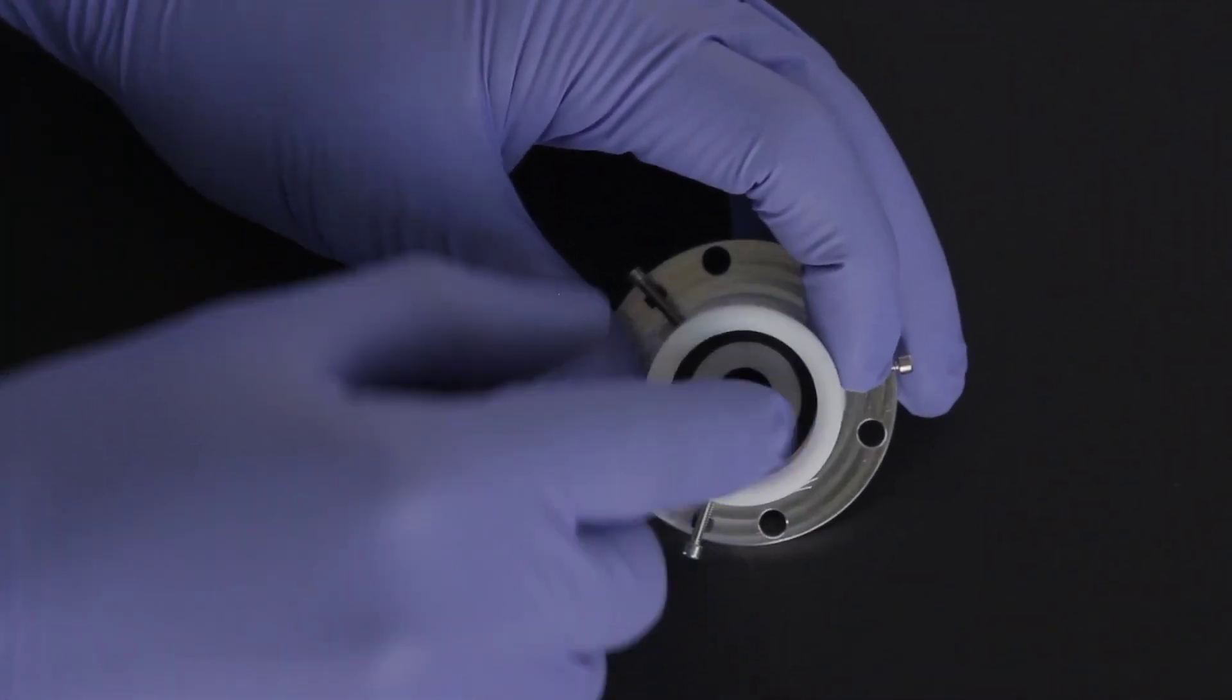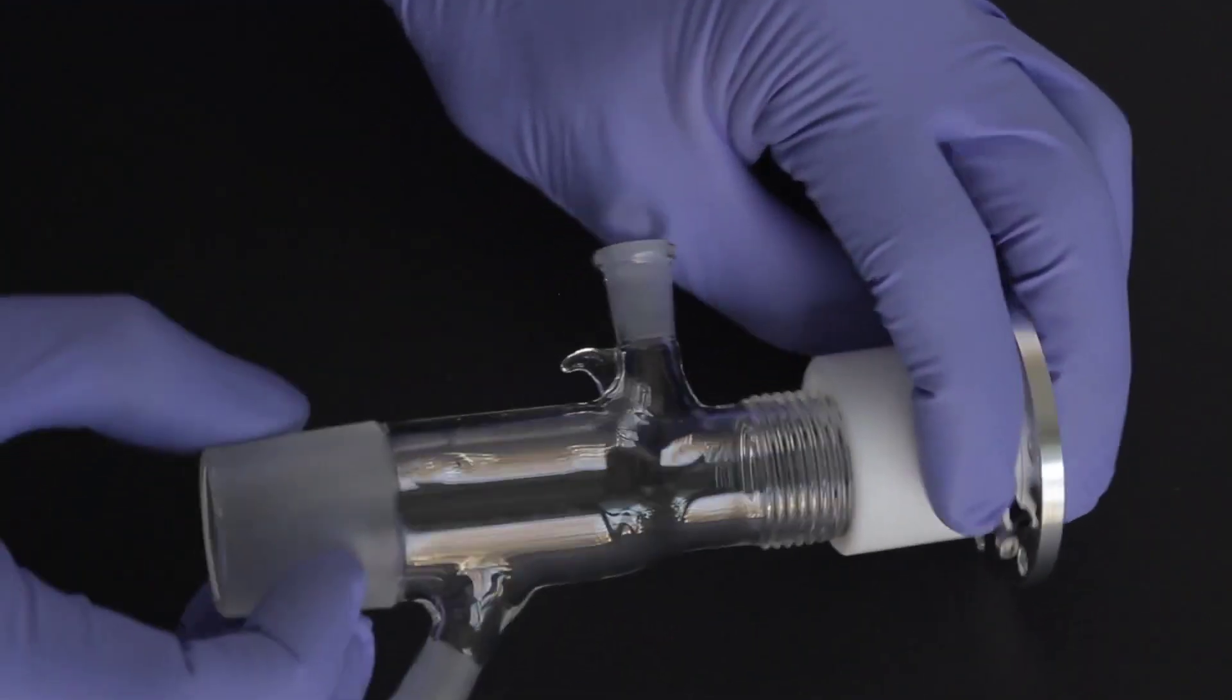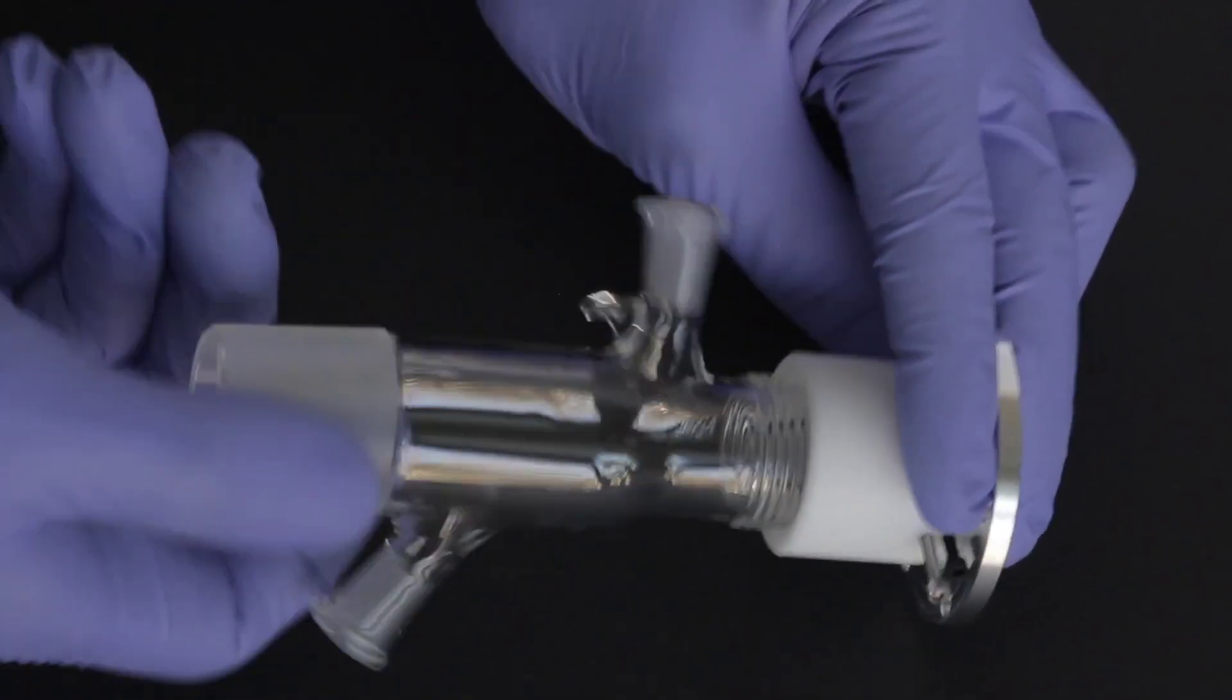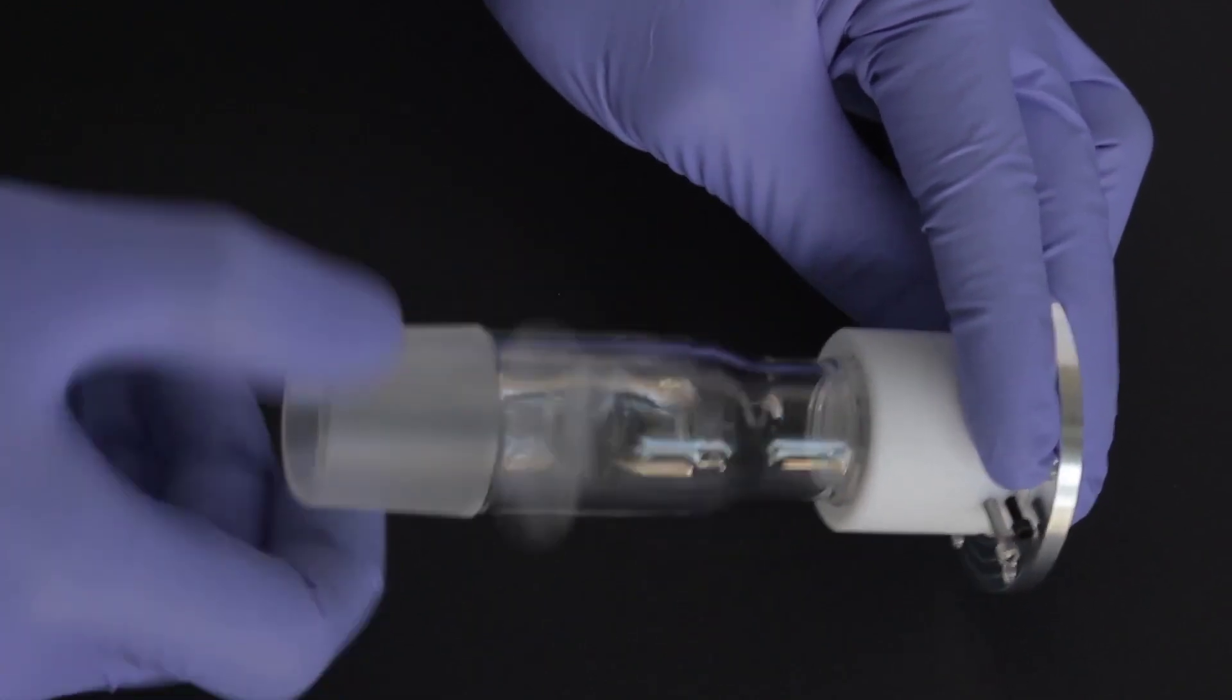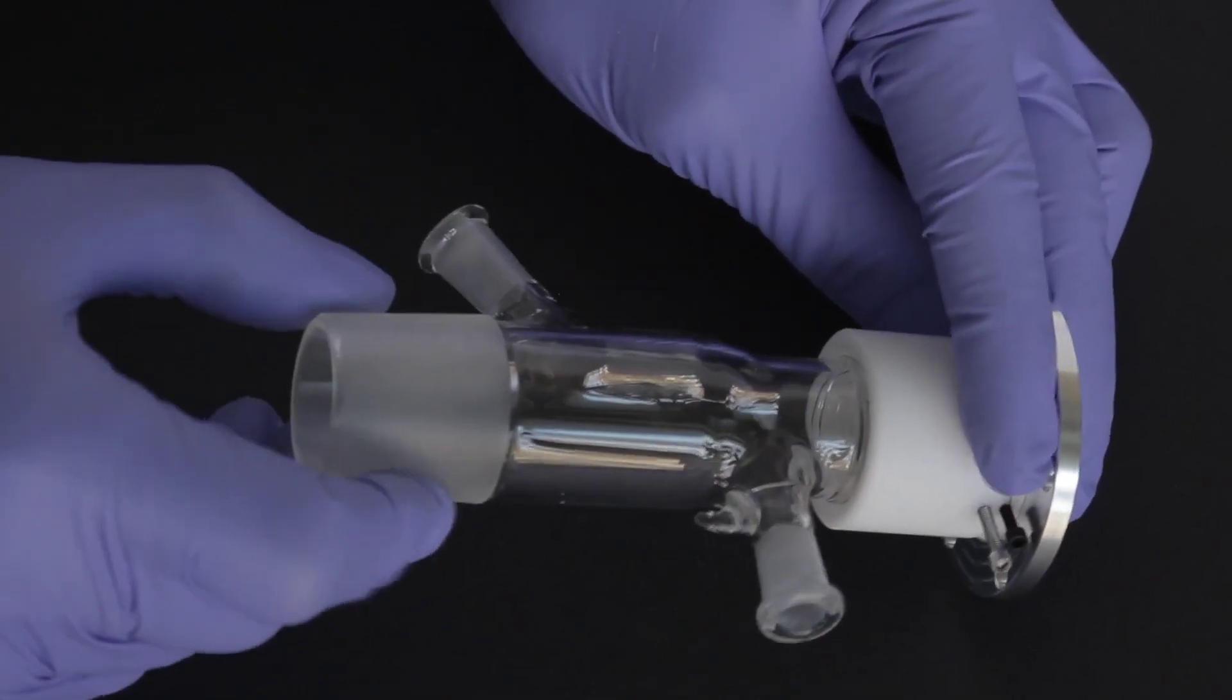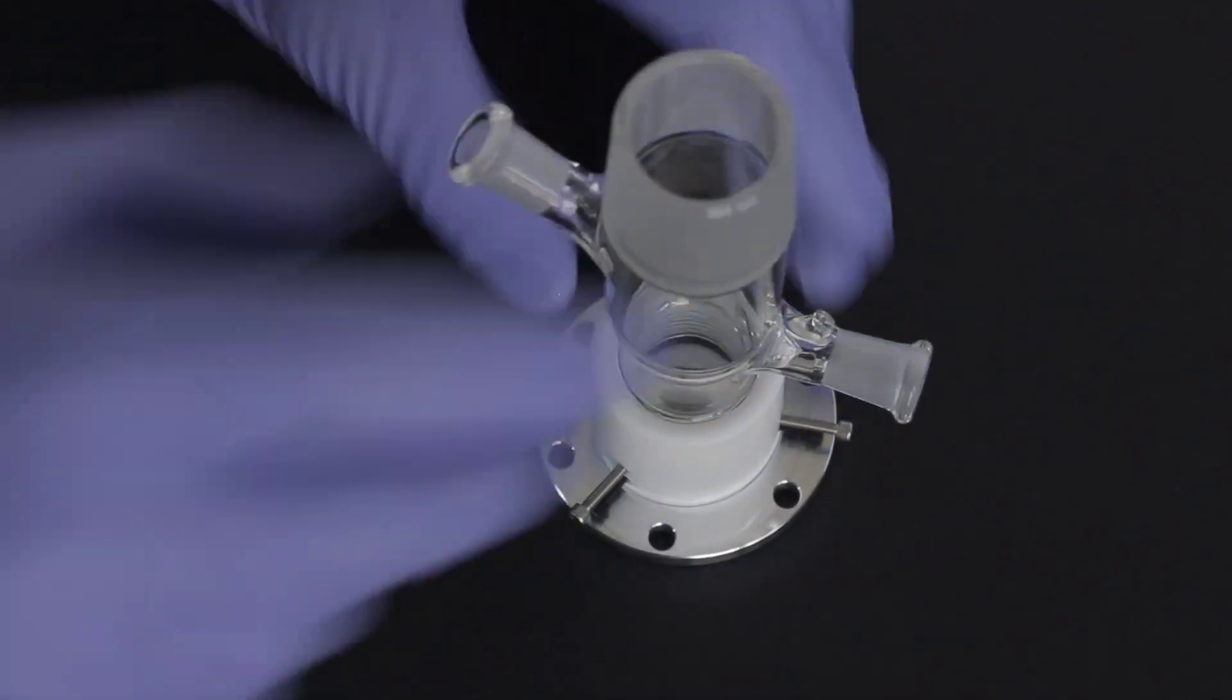Flip the cell base over and install the upper o-ring. Screw the glass cell body into the base until it bottoms out and seals against the o-ring. Only a small amount of torque is required to seal the cell. Do not tighten any more than 1/8th of a turn after the point where you begin to feel resistance.